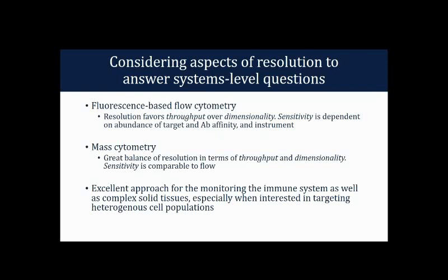So this makes it an excellent approach for monitoring systems that are complex and contain hundreds of cell types, like that of the immune system and complex solid tissues such as tumors and other complicated solid tissues.